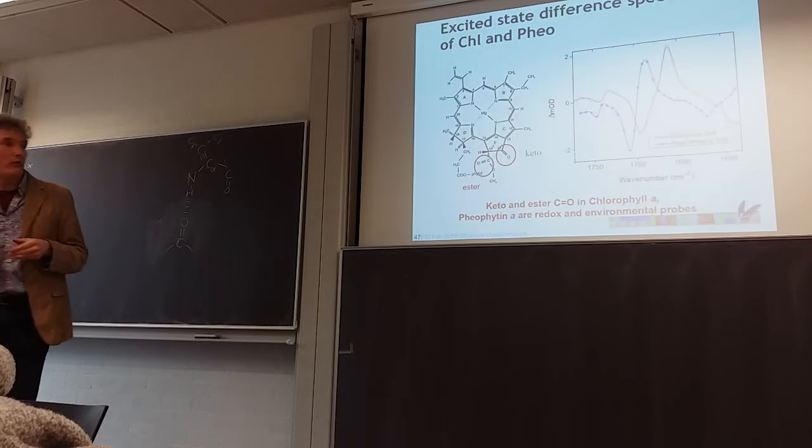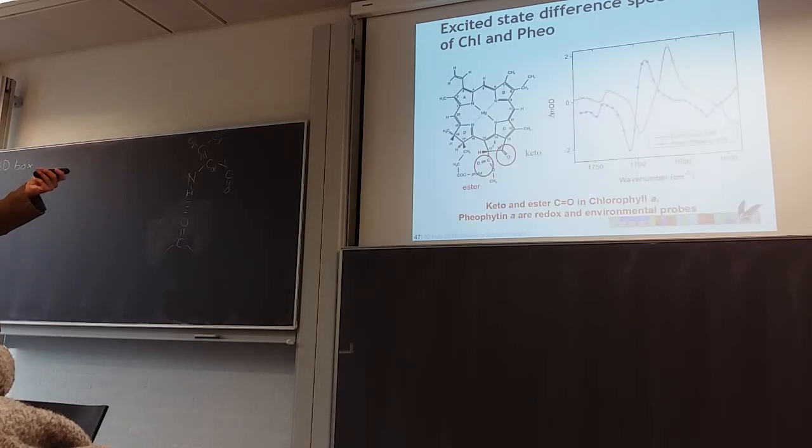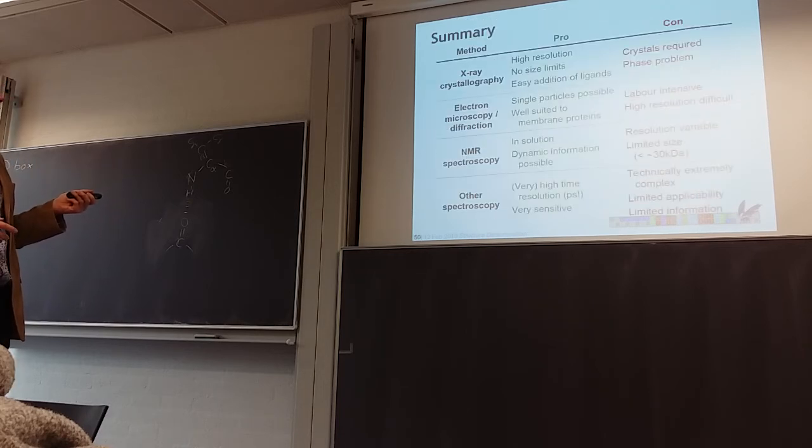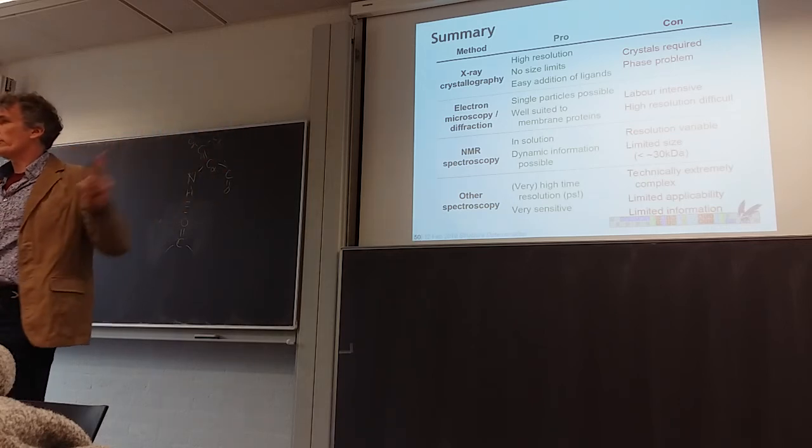There's some example of infrared spectroscopy on the details of the chemistry, but I'm not going to go into detail there right now. And this is just a summary of the methods that I've been explaining.